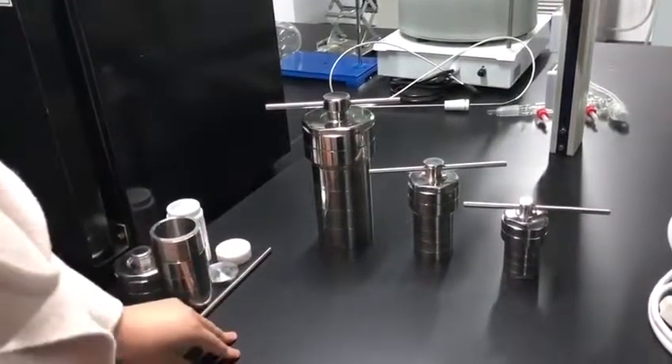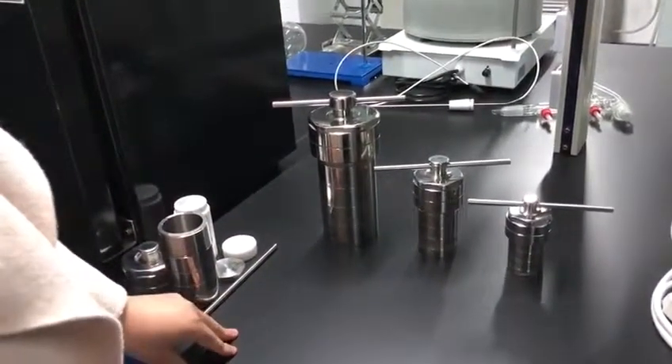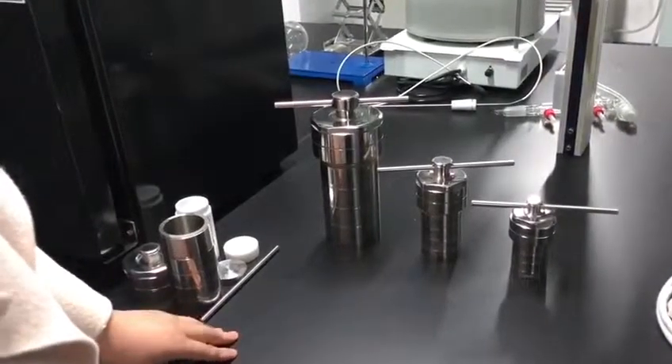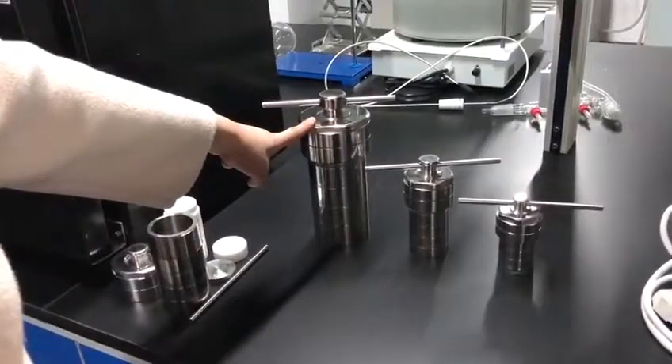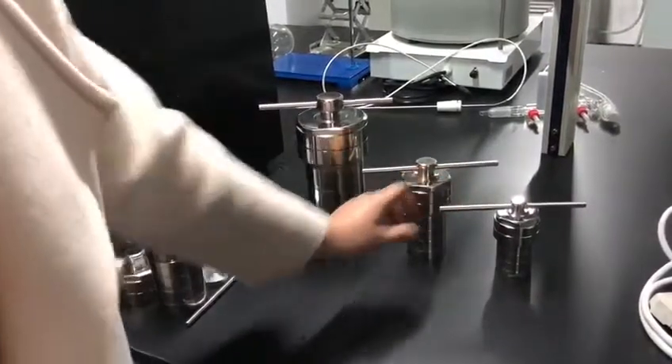Hello, our company is ZZKB Zhengzhou Kedah. This is one of our favorite products. It's called a hydrothermal synthesis reactor.